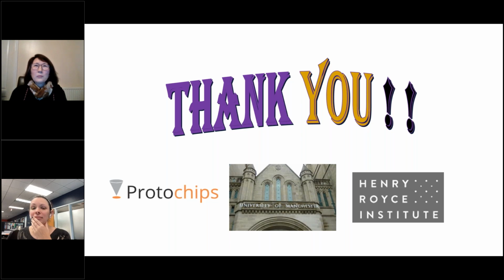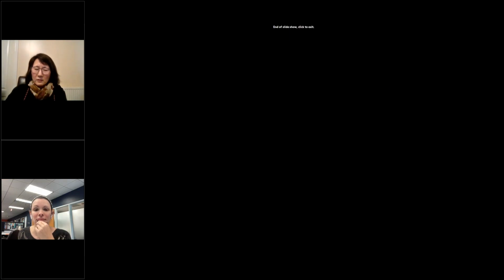Yes, I think, if it's for the electrical, see in the glue method, actually the last photo, in that study, we used electrochemical cells, which have the electrodes on the chips, on the protochips. So after using the glue method, we indeed use electron beam deposition of a thin layer of Pt on the area between. Maybe, if you can still see that photo, let me see if I can find that one.